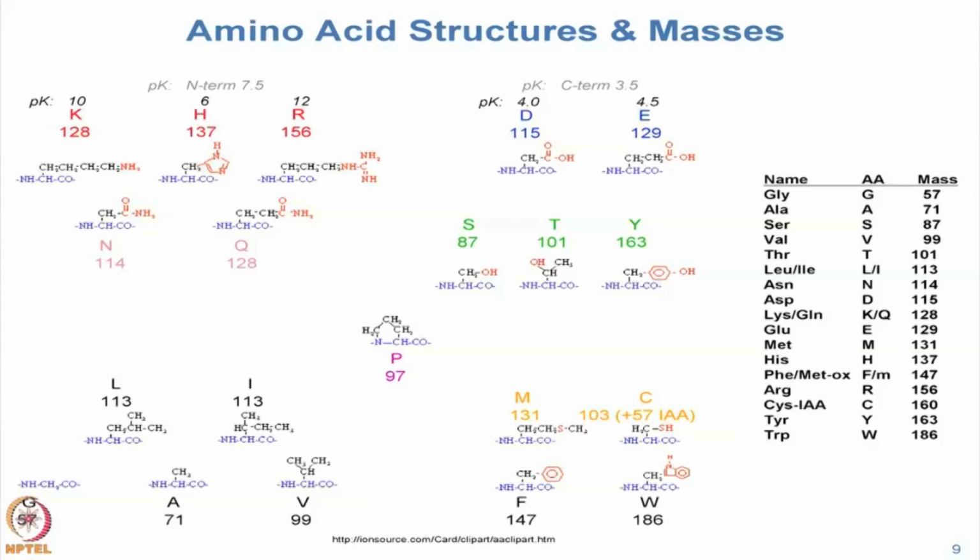The side chain is bound to the backbone, and it likes to retain charge there, and so you get a nice huge peak in an MS-MS spectrum when there's a proline, and you get an ion cleaving on the N-terminal side. Okay? We could not do proteomics if it wasn't for these three amino acids, in particular lysine and arginine. Okay? They are basic, they bear charge, they're the basis for making the ions have charge.